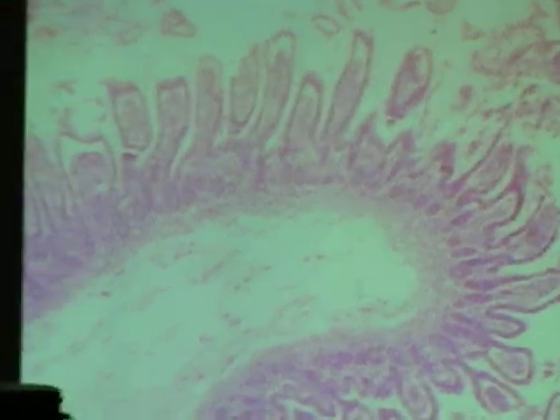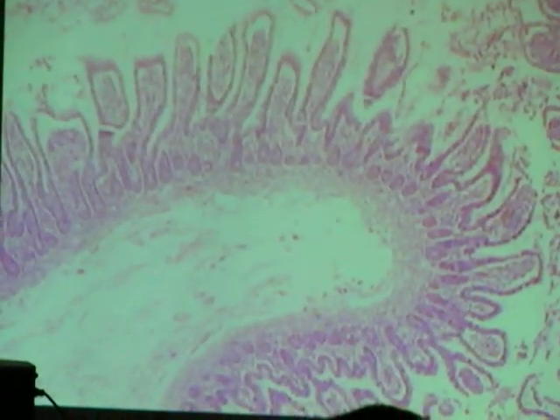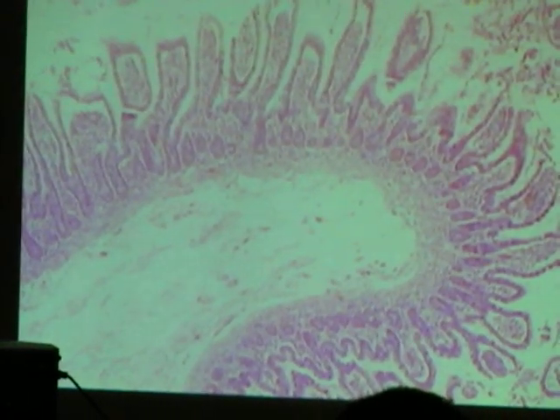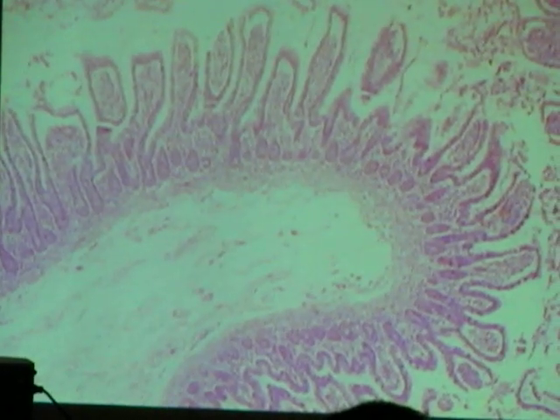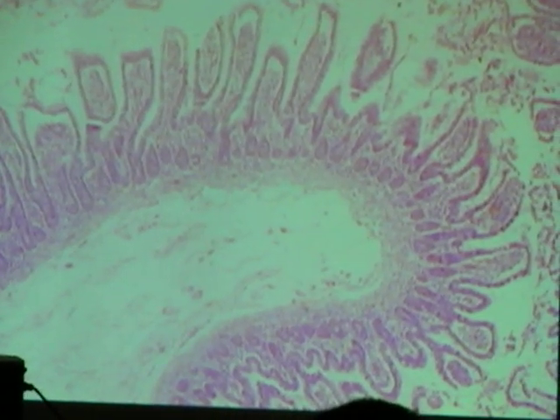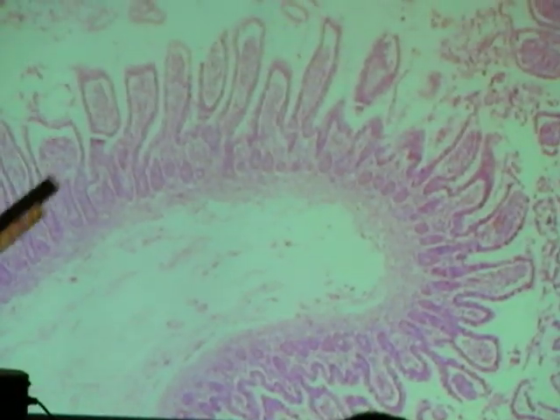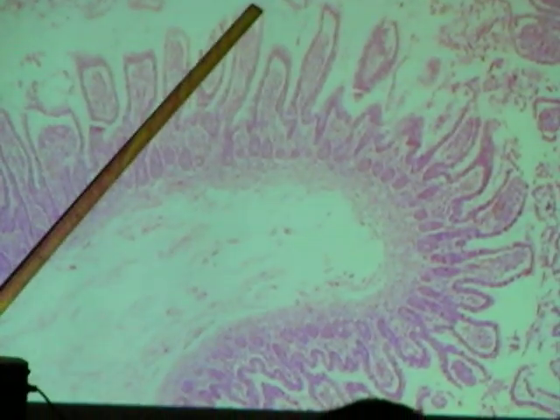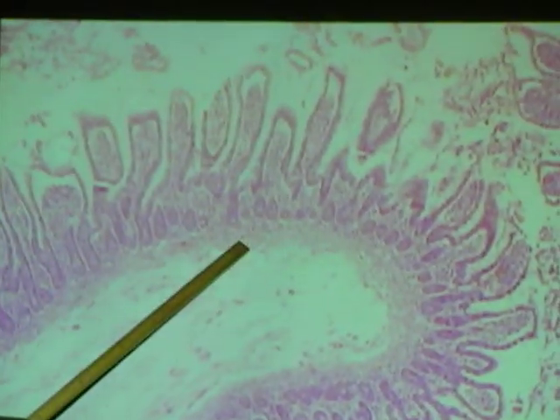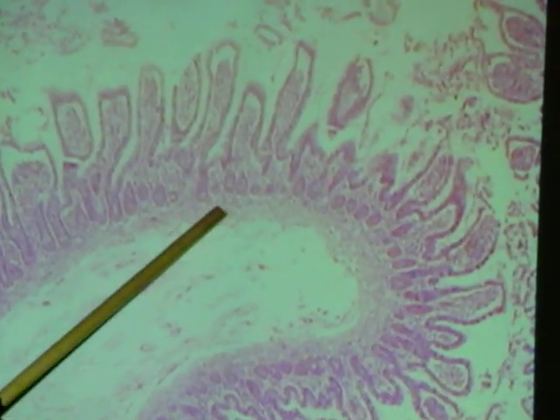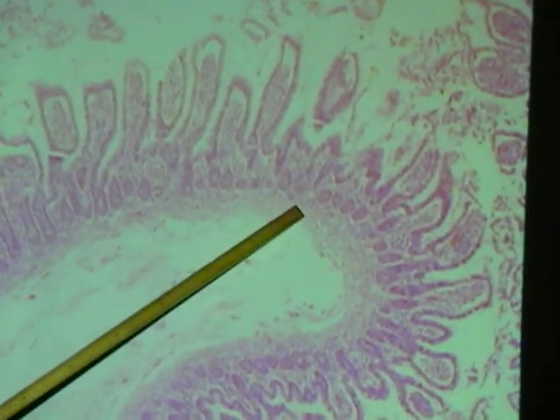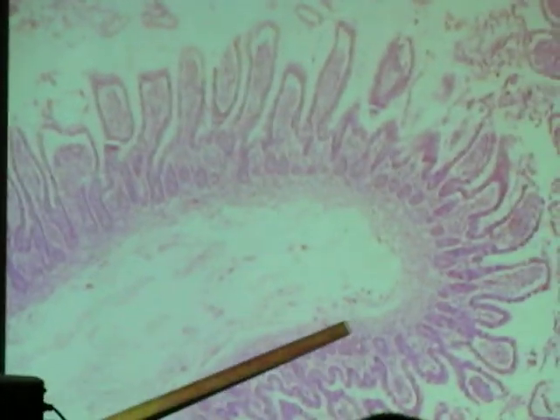Okay, so on this one, we still have our three major layers. We go from the top of the villi all the way down. That's always the bottom of the layer.